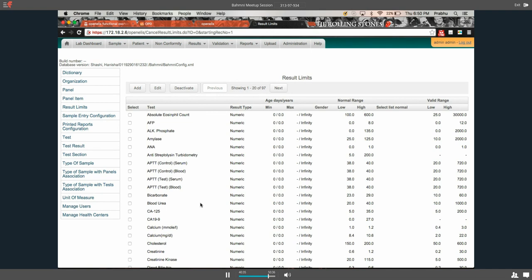There are some tests where you get a numeric value if it's within range of the equipment that does the test, or you get a value that says basically greater than, because it hasn't been measured accurately. So the value is either numeric or essentially textual, depending on the result from the equipment.